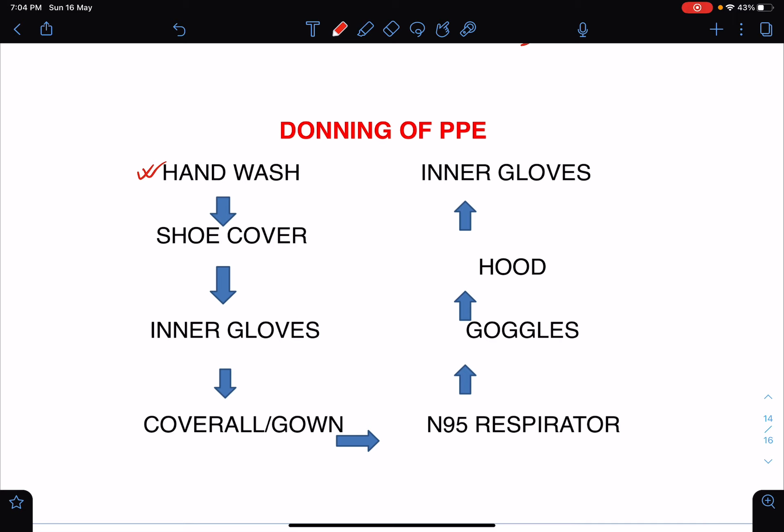Following hand wash, you can wear the shoe cover, which should be followed by wearing of the inner pair of gloves, then the coverall or the gown, followed by the N95 respirator or surgical mask — whichever you are using — which is to be followed by wearing of goggles, followed by the hood, and then ultimately the outer pair of gloves. This is about donning of PPE.